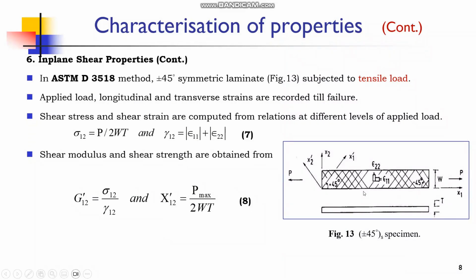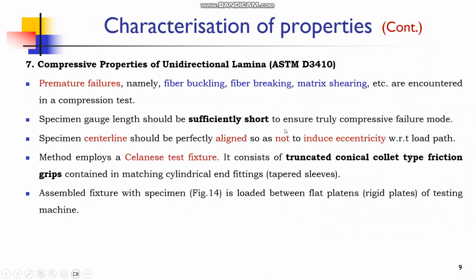Figure shows the specimen, which is a symmetric laminate with plus minus 45 degree, subjected to tensile test. Compressive properties of unidirectional lamina are determined using ASTM D3410 standard.